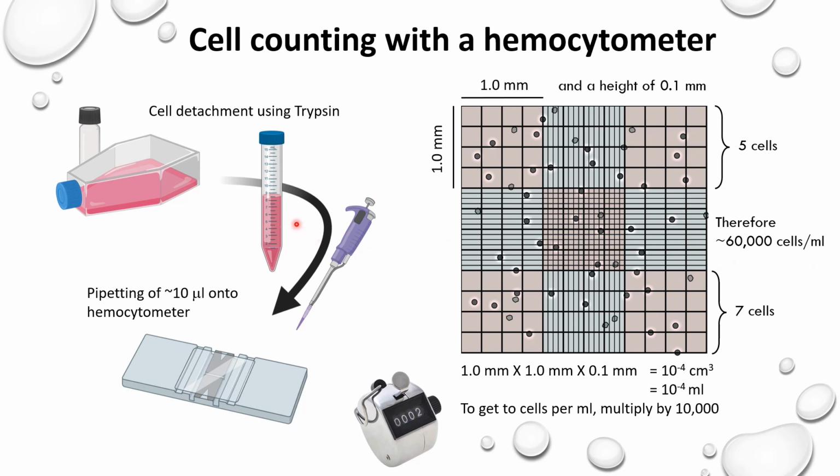You have 10 ml in total, so you have 600,000 cells in total that were in your flask and are now sitting in your tube in a volume of 10 ml. This will allow you to do further calculations in order to understand how you can take 1,000 cells into each of the 96 wells. I hope this is clear.